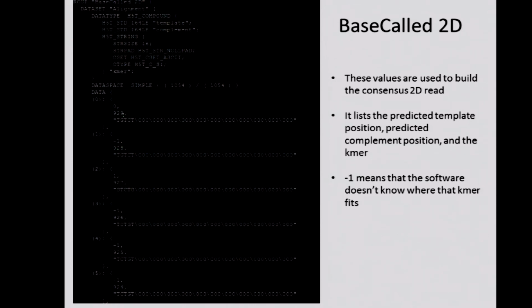It doesn't always work well, but if you look here, you can see that shift. So this is T, G, T, C, T, and then we have G, T, C, T, G. So you see how they line up. They shifted over by one base. This and this, they're the same. You have a problem. That's reflected also in this -1 value. This -1 value means the model has nowhere to put that piece.